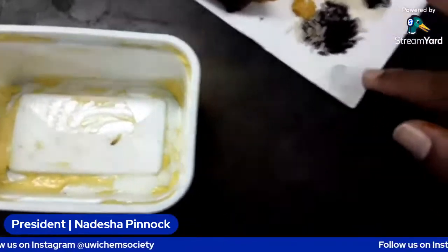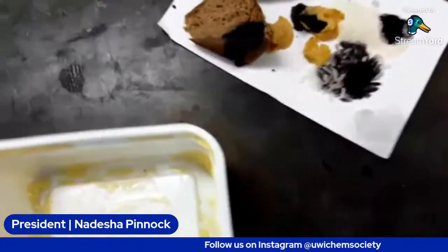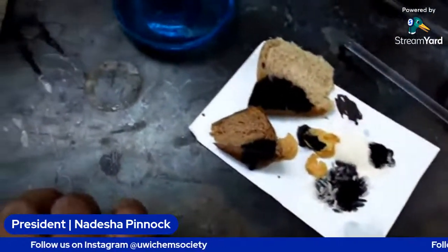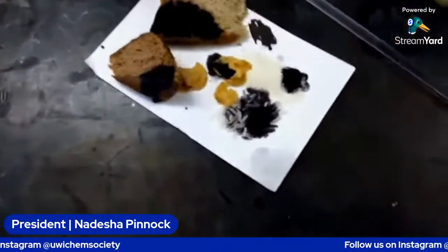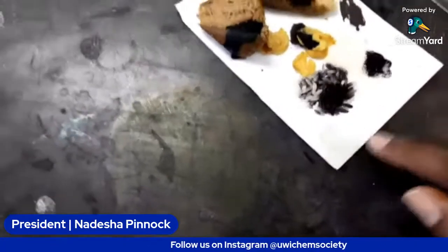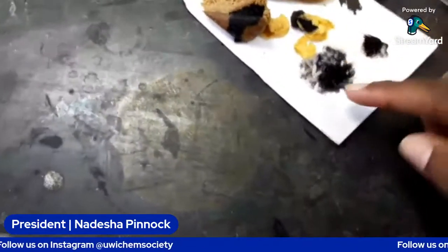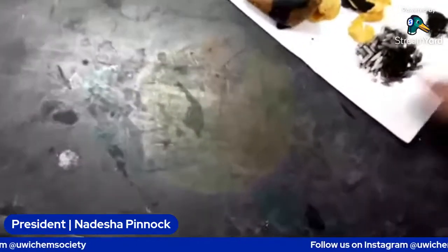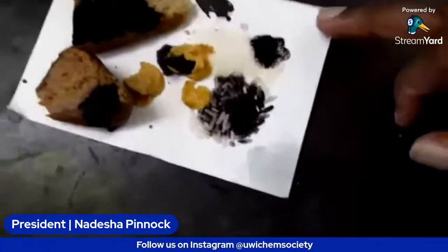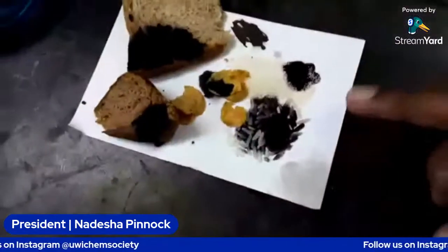So that's the easier test for fats or lipids. The smear test, you just use a paper, something you can do simply at home. Smear the substance on the paper, and the translucent spot will tell you that you have a fat. The difference with something that is not a fat is that the paper is going to get wet, but eventually it will dry and it will look like this again. But with this, it's never going to go back to this.